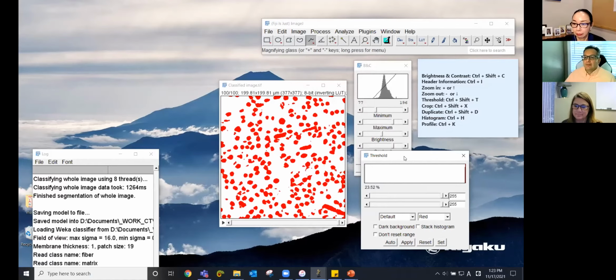So maybe after, you can put those shortcuts in the notes somewhere, so people can get those really quick. I think that might be helpful in general. You know what I can do? I have a longer list, a big list of shortcuts, and we can put that on our website so that you can download it later.